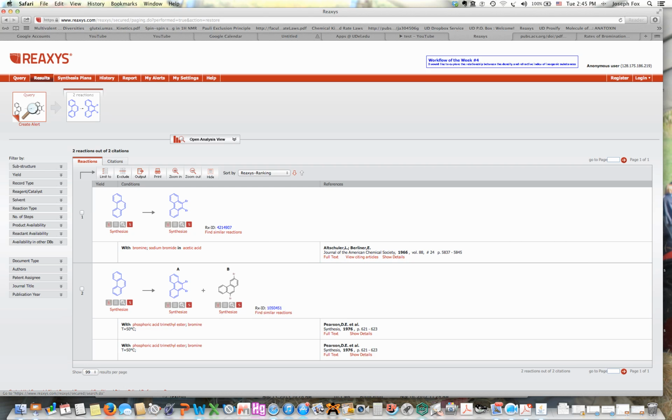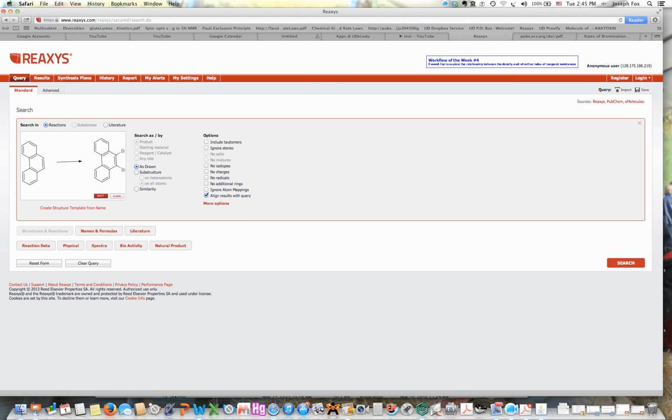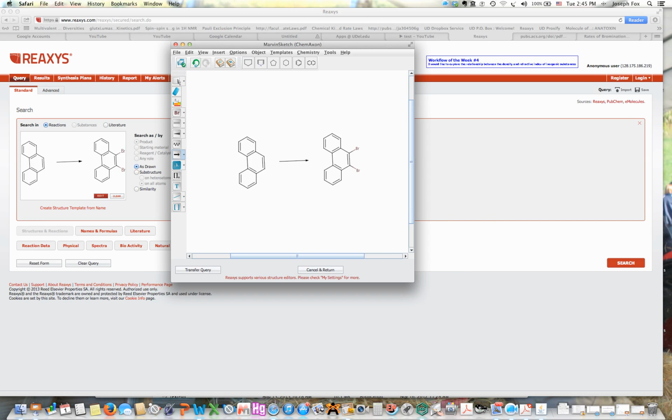So one last thing I'll show you is, let's go back then. So this was a successful search. Really what we wanted out of this was our references so that we could get conditions. If we go back to the query, I'll show you one thing, that in reaction searching, we can also use our free site feature.